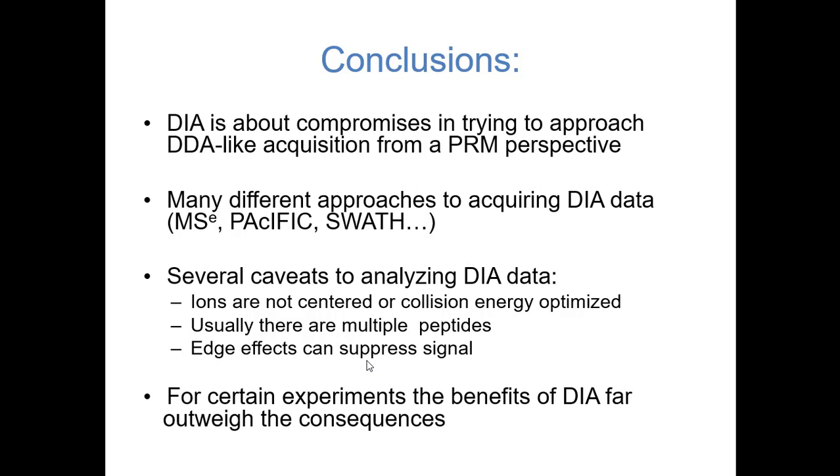That's why you need to do MS3, to pick specific fragment ions to go after that peptide specifically. That requires that you, A, have an instrument able to do that, so you're limited to a Lumos, basically, and to be able to do that fast enough.